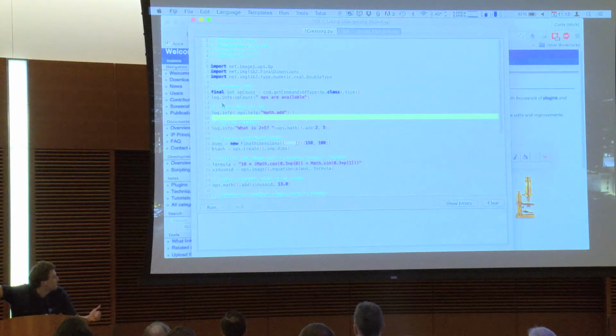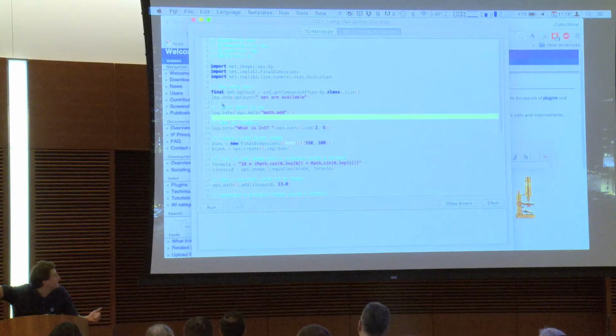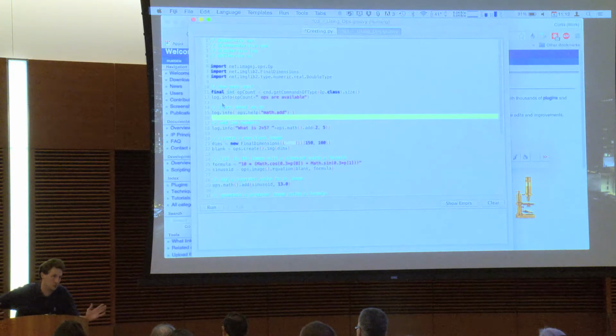When I say math.add, what that means is contextual. It depends on what I'm adding. If I'm adding 2 numbers, you'll get another number. If I'm adding 2 images, you'll get another image, and it does it pixel-wise or whatever. The main takeaway about ops from a rigorous mathematical standpoint is that they have to be deterministic. They have to always produce the same results with the same inputs. So if you write your own math.add op, which extends the types of things that can be added, or you do it for performance, so you're like, I can add 2 and 2 faster than numbers in general, so you write the add 2 and 2 op, and it only works with 2 and 2, and it's just faster. If you do that, you still have to return 4. You're not allowed to return 5, because if you do that, then that will seriously break expectations, and I would call that a bug.